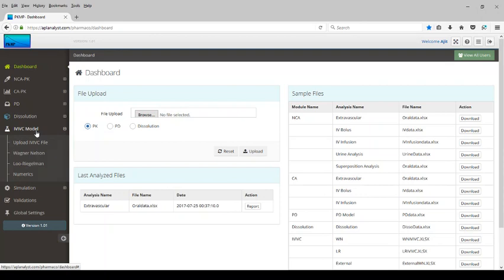The file has three components. One is the IV-IR data that is needed for the computation of disposition parameters. Then the dissolution data needed for the dissolution analysis. And the in vivo data needed for the computation of deconvolution parameters using the Wagner-Nelson method or other methods as appropriate.